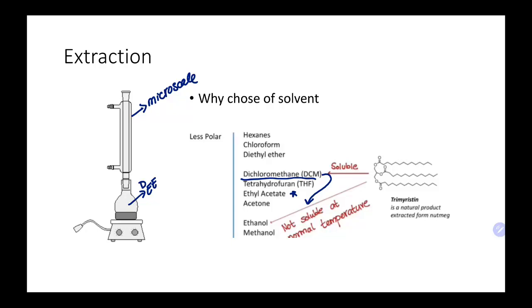There are some published studies with diethyl ether, so that's why you're using diethyl ether. But if we wanted to do a project and see if the ethyl acetate worked, this could be an example. You could try acetone, but I know the acetone doesn't work as well. It dissolves too well. Some of the material and tetrahydrofuran. There is a version of that, a methyl tetrahydrofuran, that's greener. Tetrahydrofuran itself is actually not green.